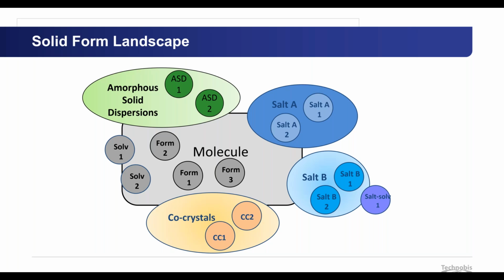But it still doesn't reach the physical-chemical properties that we are looking for to be able to bring that specific API to a larger scale. So a normal way of developing the molecule that you have, you would look into how to improve those properties.